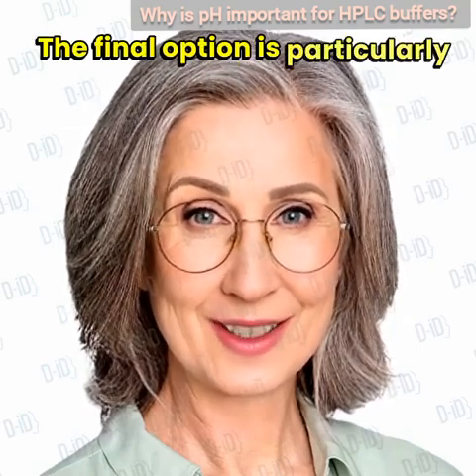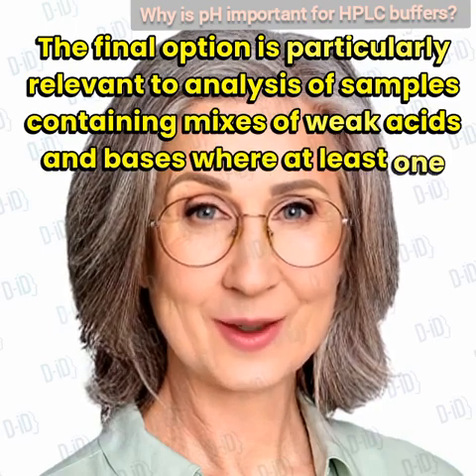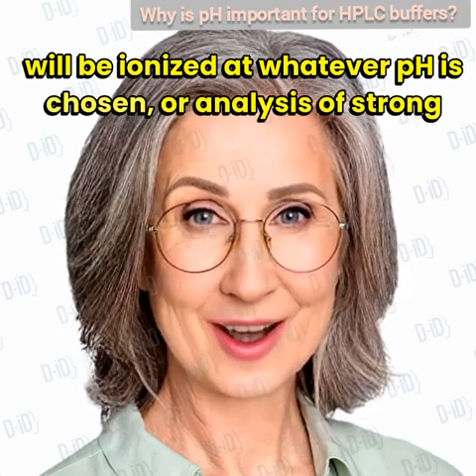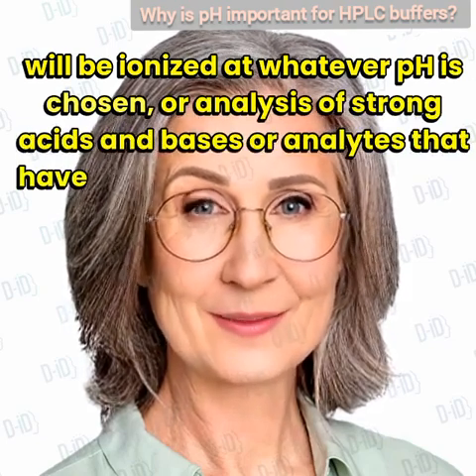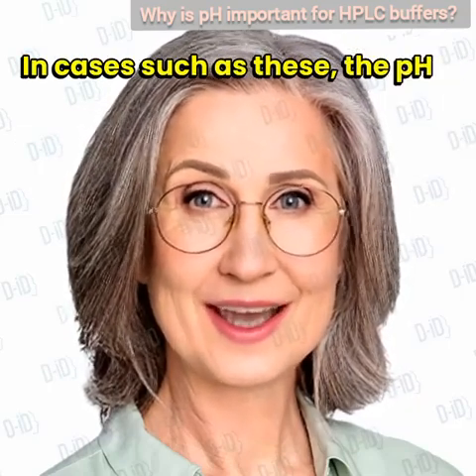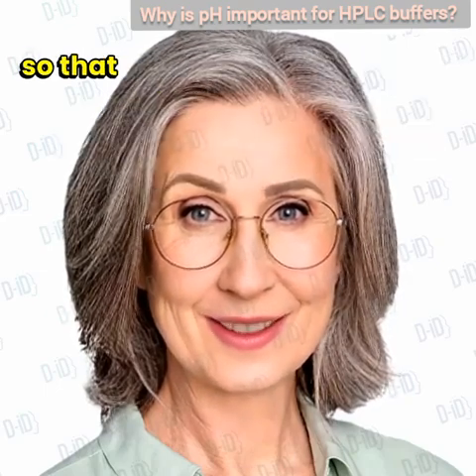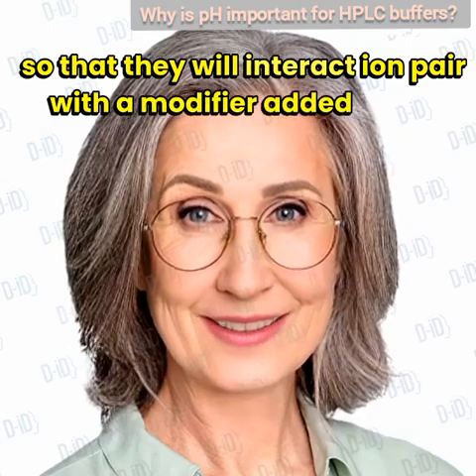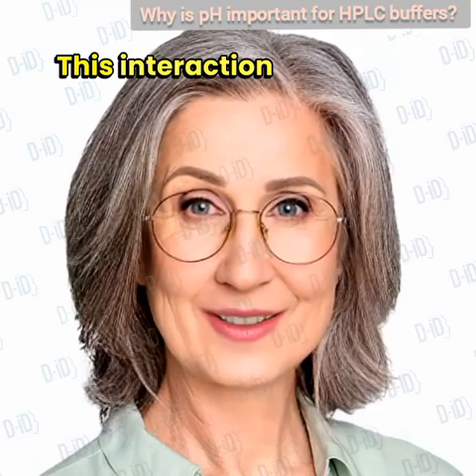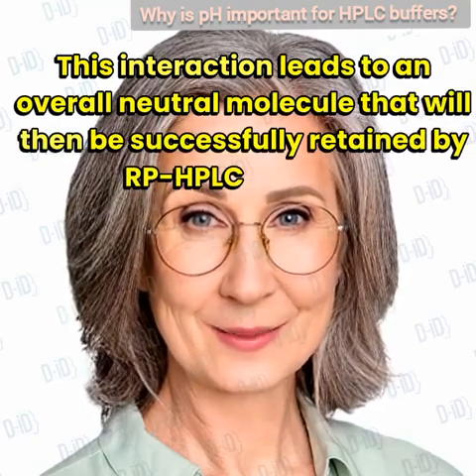The final option is particularly relevant to analysis of samples containing mixes of weak acids and bases where at least one functional group will be ionized at whatever pH is chosen. Or analysis of strong acids and bases, or analytes that have multiple functional groups. In cases such as these, the pH of the mobile phase is used to fix the relevant analytes in the ionized state, so that they will ion pair with a modifier added to the mobile phase that carries the opposite charge. This interaction leads to an overall neutral molecule that will then be successfully retained by a HPLC column.